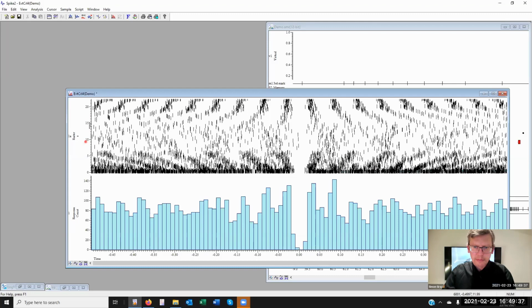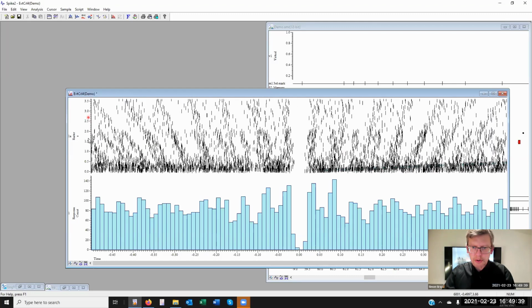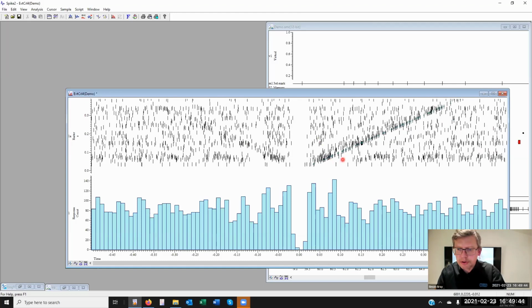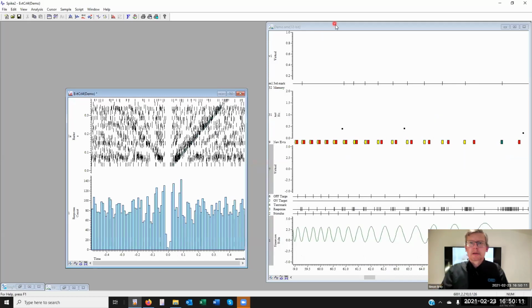And where are you? Where have you gone? There we go. Right, hidden down here. I hope you can see this line here of blue markers. So those are the times set in order from the closest to the trigger point all the way through to the longest duration over on the right here. Okay, sorry I can't increase the size of the symbols there, I should be able to. Right, there we have that.